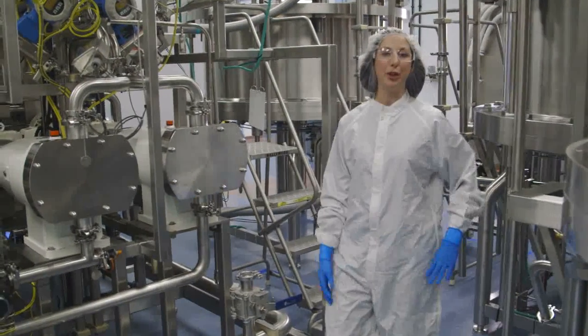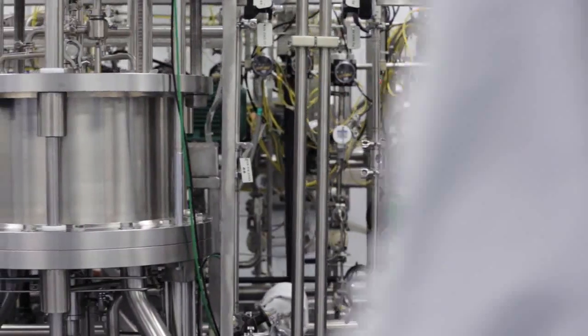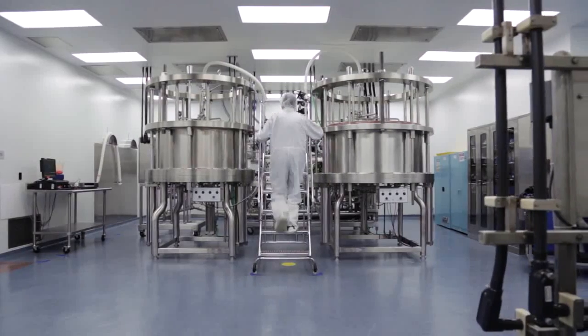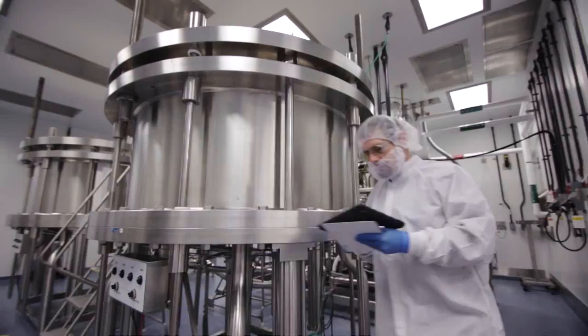Hi, I'm Tracy, and welcome to purification. At this point in the process, the cells have produced all of the protein that they're going to, so we've separated them from the solution containing the protein. Now we're going to take that solution and purify it down to the protein that's specific to our medicine.